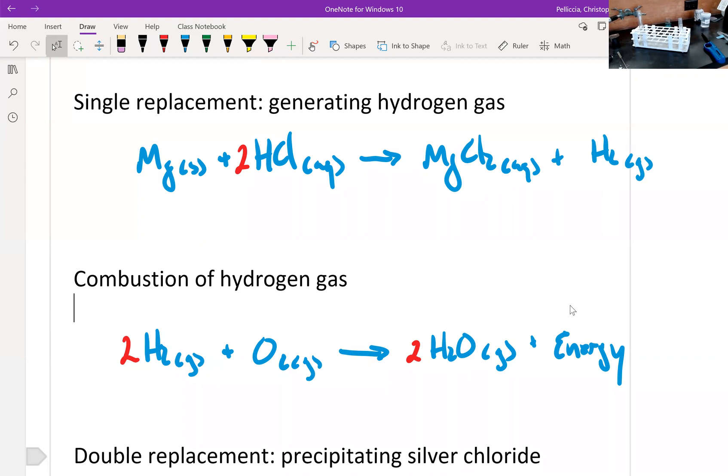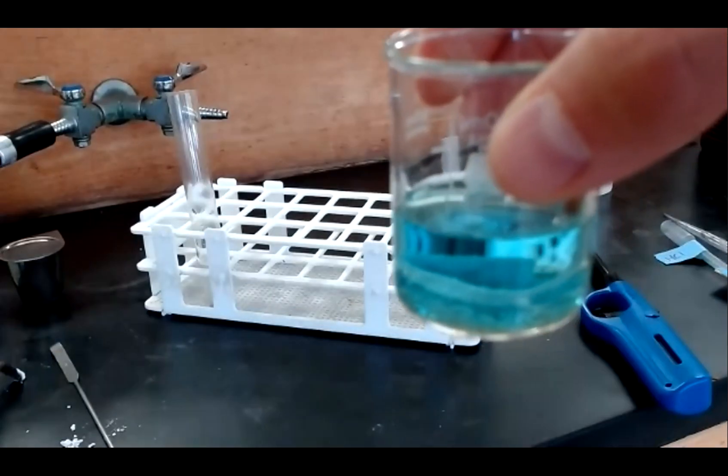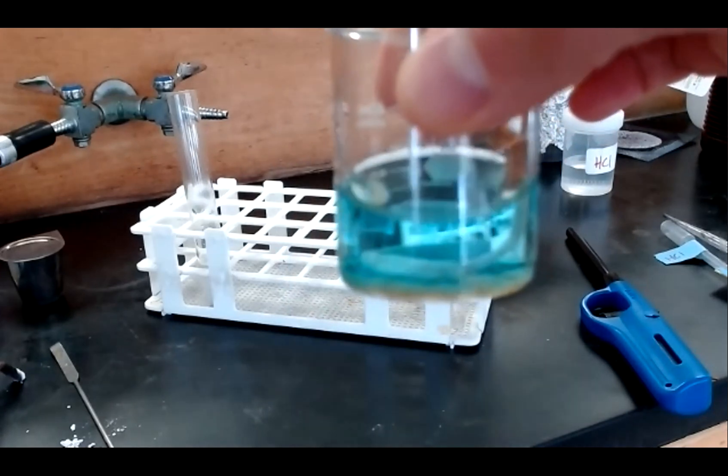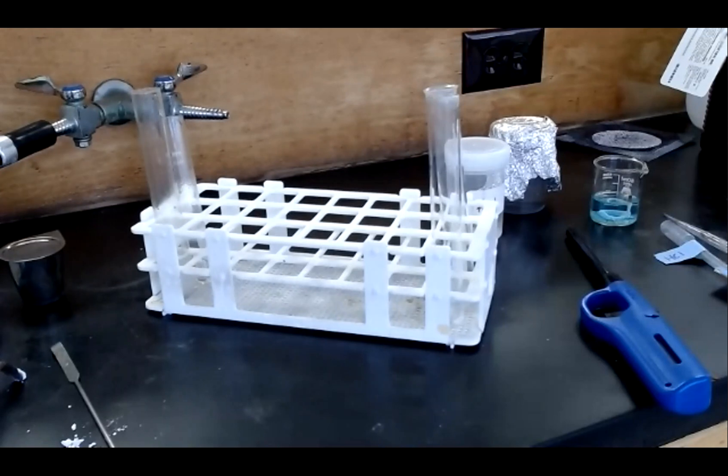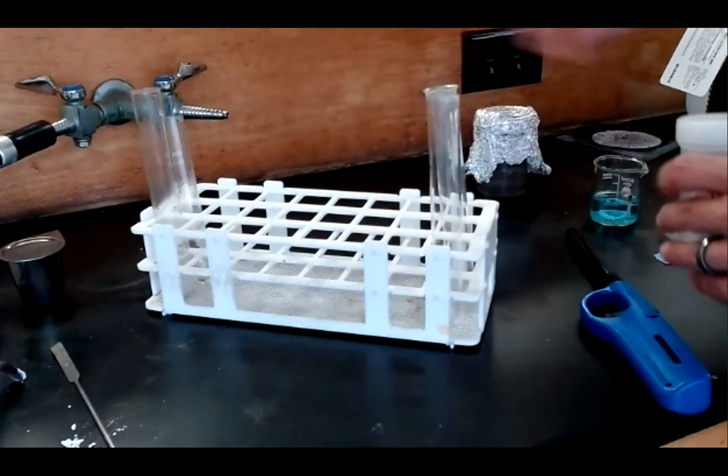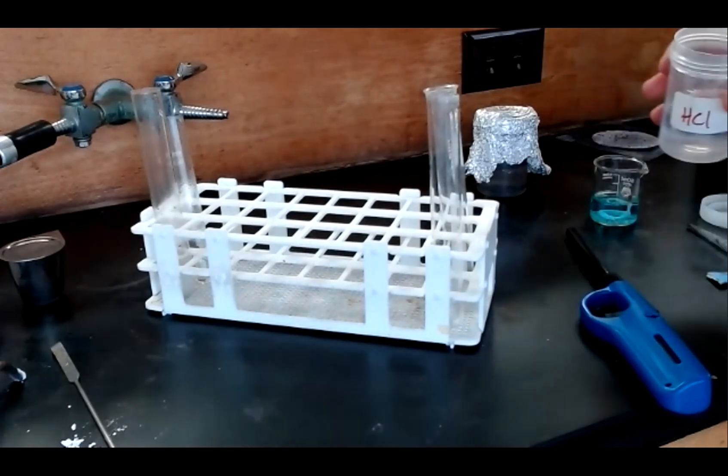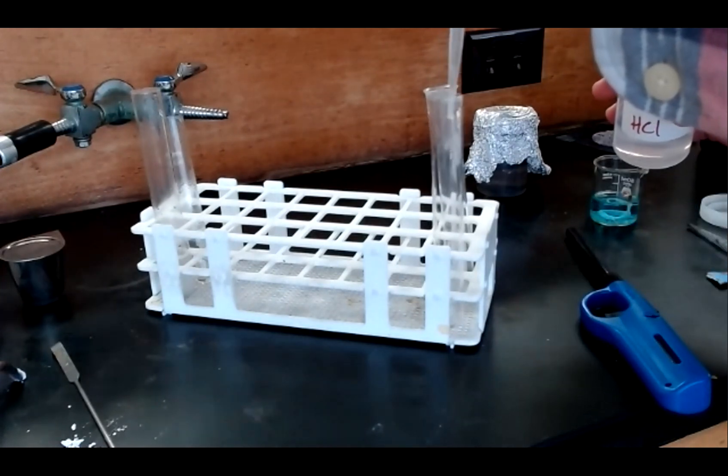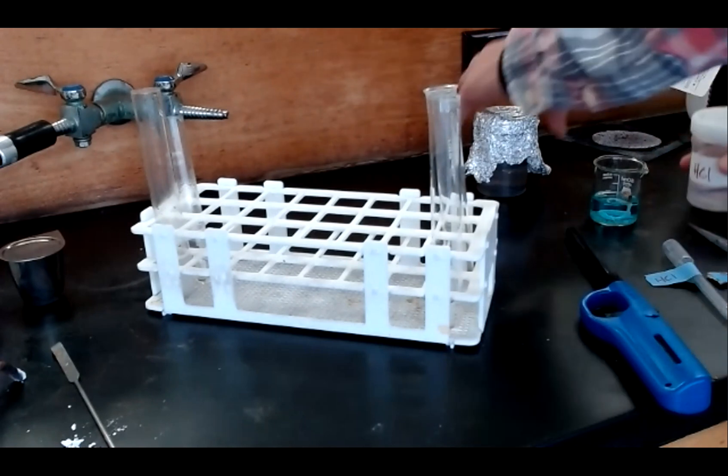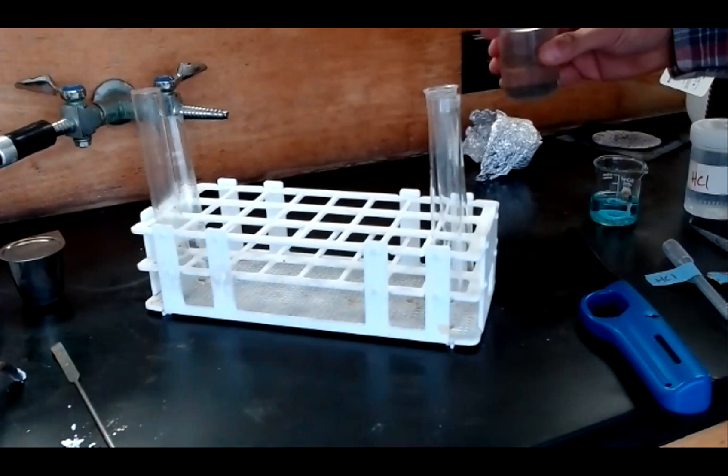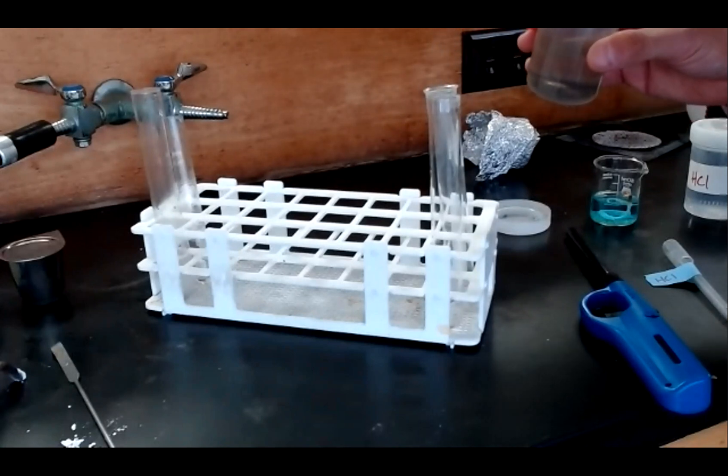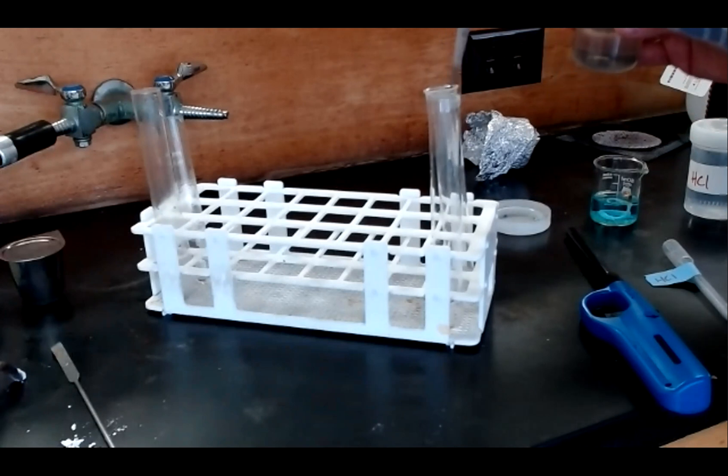At this point, I'd like to look at our final reaction. Our final reaction will involve mixing solutions of hydrochloric acid with silver nitrate. What I'm going to do here is put a solution of hydrochloric acid into one test tube and a solution of silver nitrate into the other test tube, show you the two solutions individually, and then mix them together and we can talk about what happens. You can see as I'm preparing these solutions that both are colorless solutions, clear and colorless solutions with no obvious solids in either of them. And again, I'll hold them up for you so you can see them more up close in the camera.